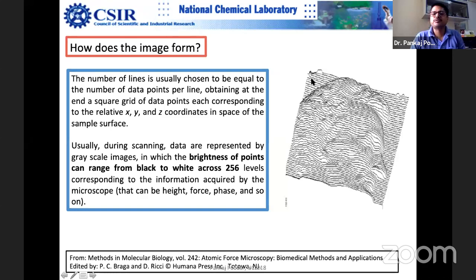So basically the position of the point becomes the coordinate of that pixel, and for example, you pick up some data. You say that here I picked up 35, here I picked up 32, and here I picked up 12. That value is basically the voltage, the topography. It can be minus also, okay, it can be minus 12. So basically you're measuring some value. So x and y become the coordinates on your sample, where exactly you are measuring, and the value z becomes the number assigned to that, the weight actually. So essentially it's a matrix, okay?